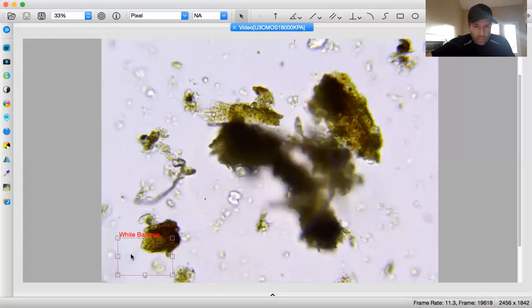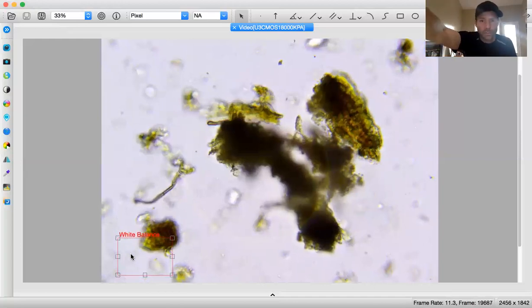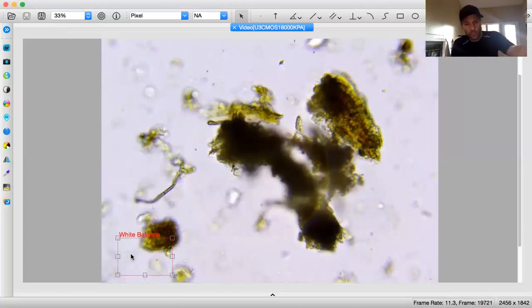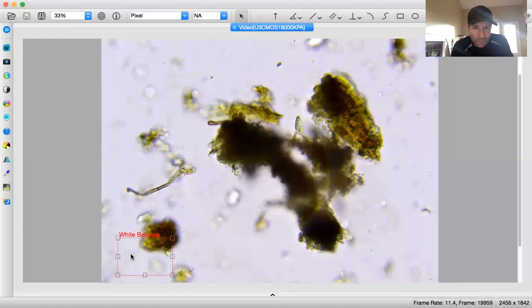So I'm thinking that's going to be, I want to say 2, maybe 1.5 micrometers, or units actually, 1.5. So let's see here, 1 to 2, 2. I'm getting about 2 even. So I'm going to call that 2.2 units in length. And as far as the diameter, I'm seeing maybe 1.5. What's that moving?